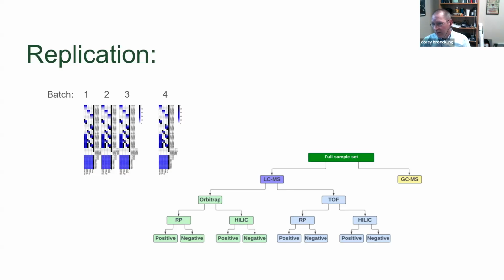So we wanted to make sure that this was reproducible in the sense that all the reagents are available. And secondly, that we wanted to make sure that the data is representative of the types of data that people are actually analyzing. So we couldn't just use reverse phase LC because there's a lot of GCMS metabolomics out there as well. And we wanted to make sure people had a data set for that. And so we ran it on all of these platforms.